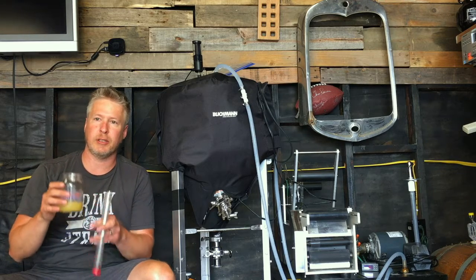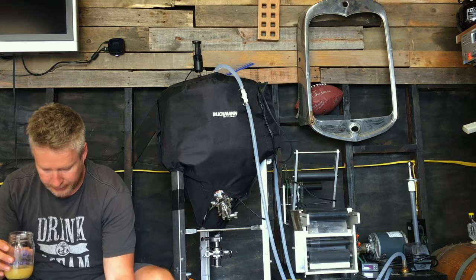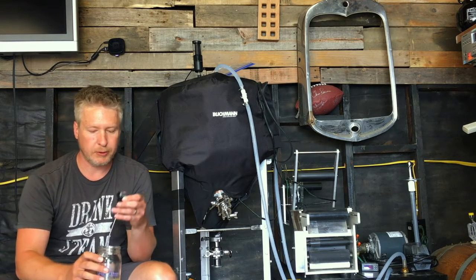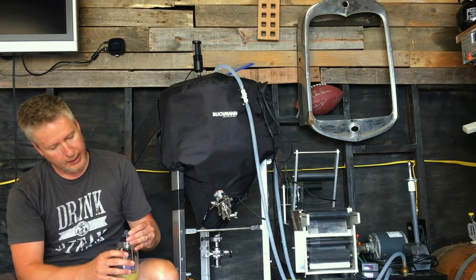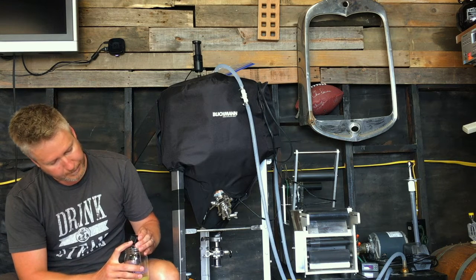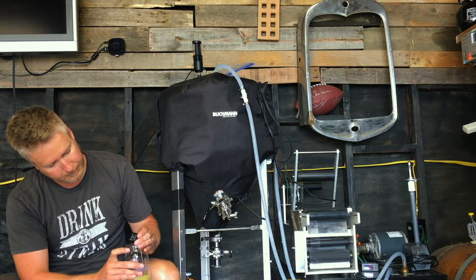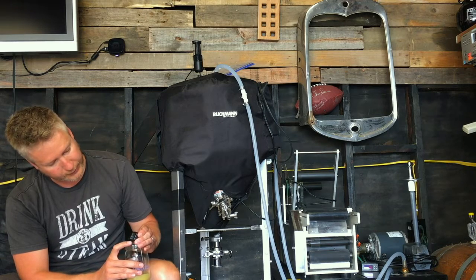So now that we've got our volume, first thing that I like to do is test temperature, and I want to do that as quickly as possible because the glass itself will actually warm up the beer some. In the case of this beer, it's currently cold crashing. So give it a second here. Let it stabilize. 5.2. So that's about 41 degrees.